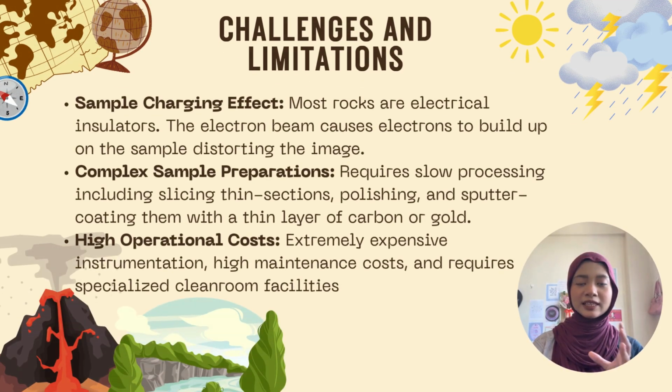However, despite these amazing potential benefits, operating an electron microscope in geological research comes with real technical and operational challenges. So, the first major challenge is the sample charging effect. Because most rocks and minerals are electrical insulators, they don't conduct electricity well.